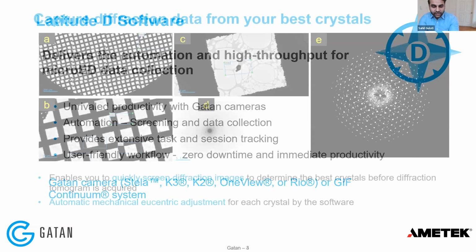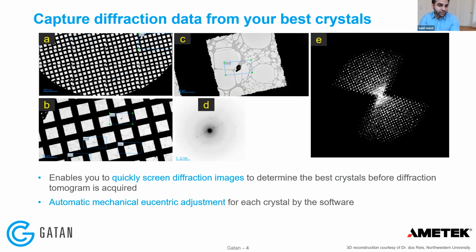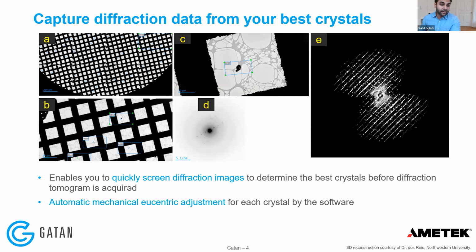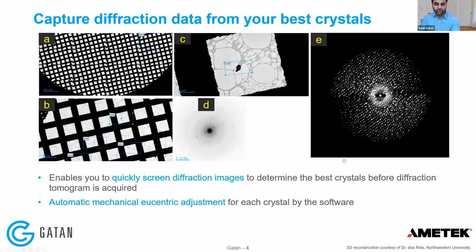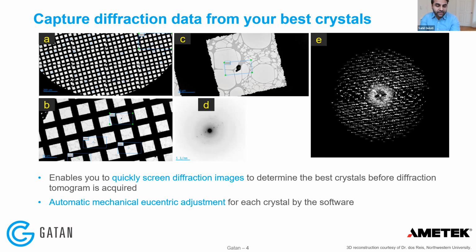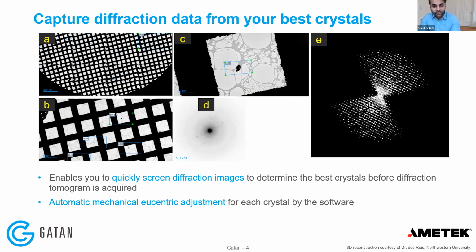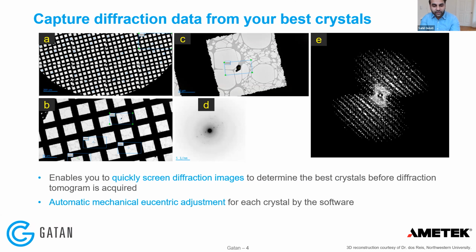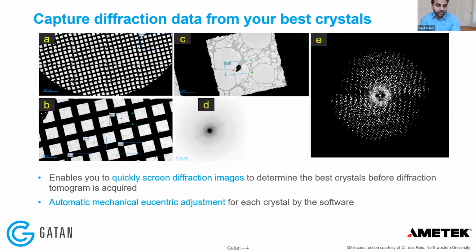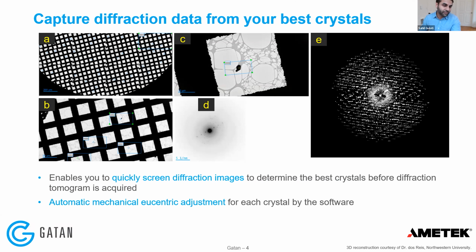There are a few more features that Latitude D offers, and these are the things that I mentioned briefly before. You have the ability to screen your crystals, make sure there is no crystal mosaicity, that the crystal is not twinned, and that the diffraction quality that you anticipate is what you're getting from that crystal. Following from there, you can decide whether you would like to collect a full tilt series on that crystal or not.